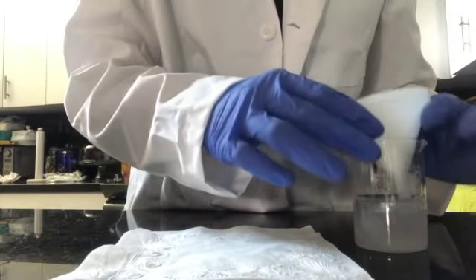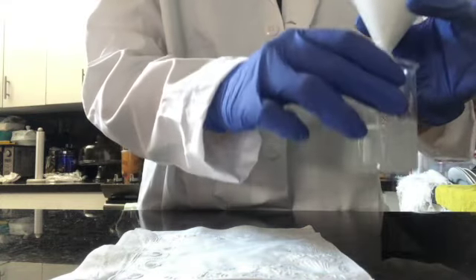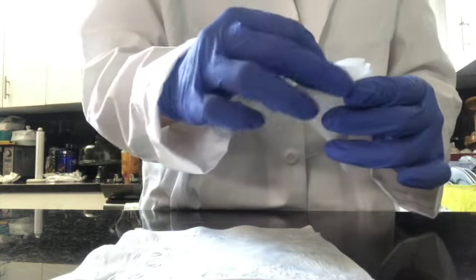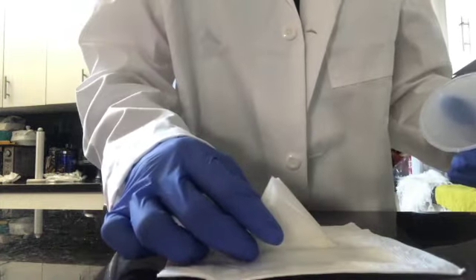Once all liquid has drained from the funnel, carefully remove the filter paper from the funnel and place it on a paper towel in a warm location. Let the filter paper dry before measuring.